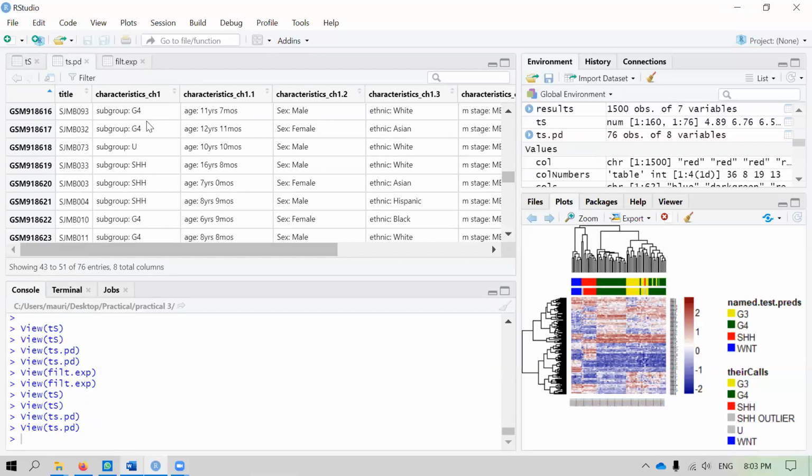Okay, so if you can arrange your data this way, these 3 pieces of data, you can actually repeat this whole 3 exercises with almost any form of data set. All you have to decide is how many groups in the original data you have. So I leave it up to you to go and think how you can apply this elsewhere. And I do encourage you to keep these 3 sets of notes with the data set so that you know how to actually analyze your own data in future.